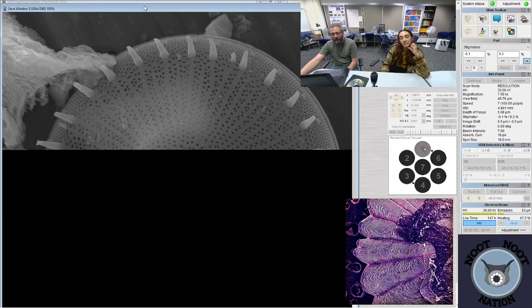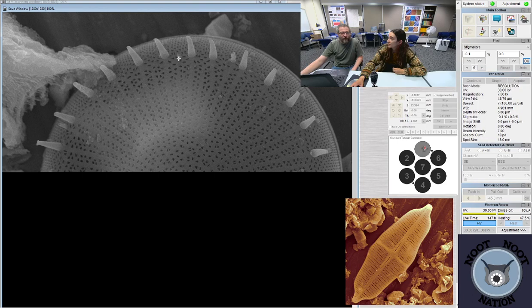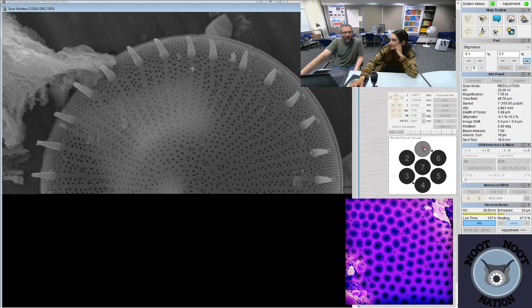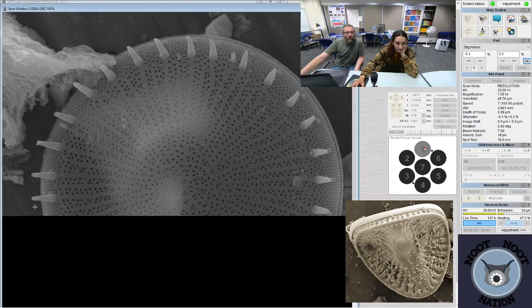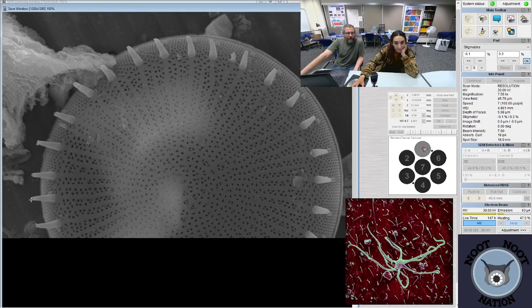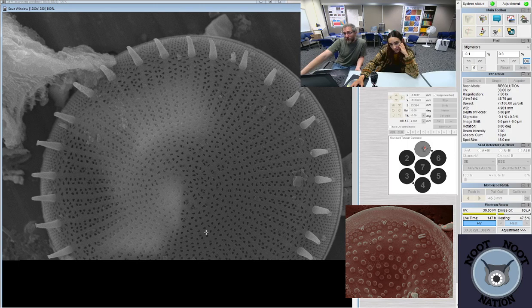Addie's looking at Clear Lake diatoms. What's the smallest thing this machine can see? Well, if you mean, like, can resolve clearly... Pretty small. I've been able to image stuff at 200,000 times, so real small. It starts to get a little bit blurry around 150,000, so the picture quality you need to really sit and spend a long time with if you want to try to get things that are that small. But if something is probably 500 nanometers, we could get it resolved closely enough. So that's pretty small. That's half of a micron. And I think probably if it were even down to 300 nanometers, I probably could still image it. It just would look a little blurry.